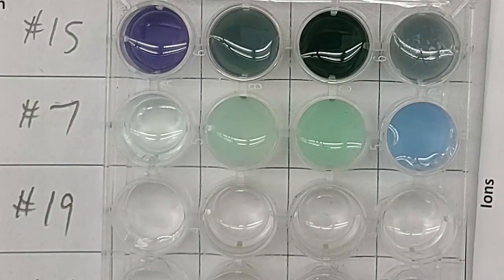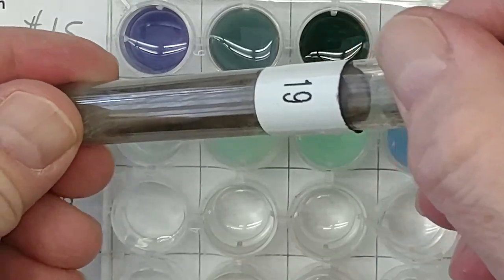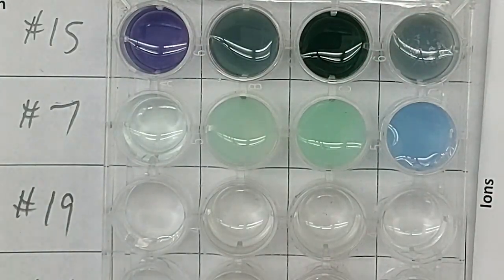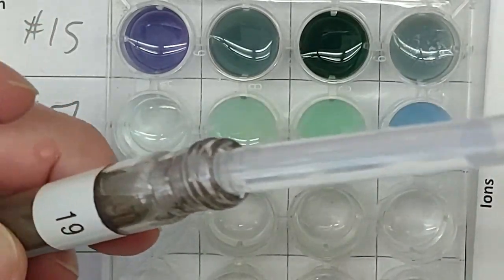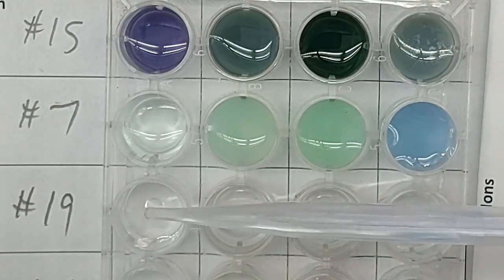19. Oh, sorry, show it to you before I add it to anything. 19. Which one did we have to ignore the discoloration of the tube for? Qualitative analysis using your spectrometers known as your eyeballs. That you can see in the pipette, it's definitely clear, colorless liquid, number 19. Number 19, clear and colorless. And we'll add a little bit to each one.